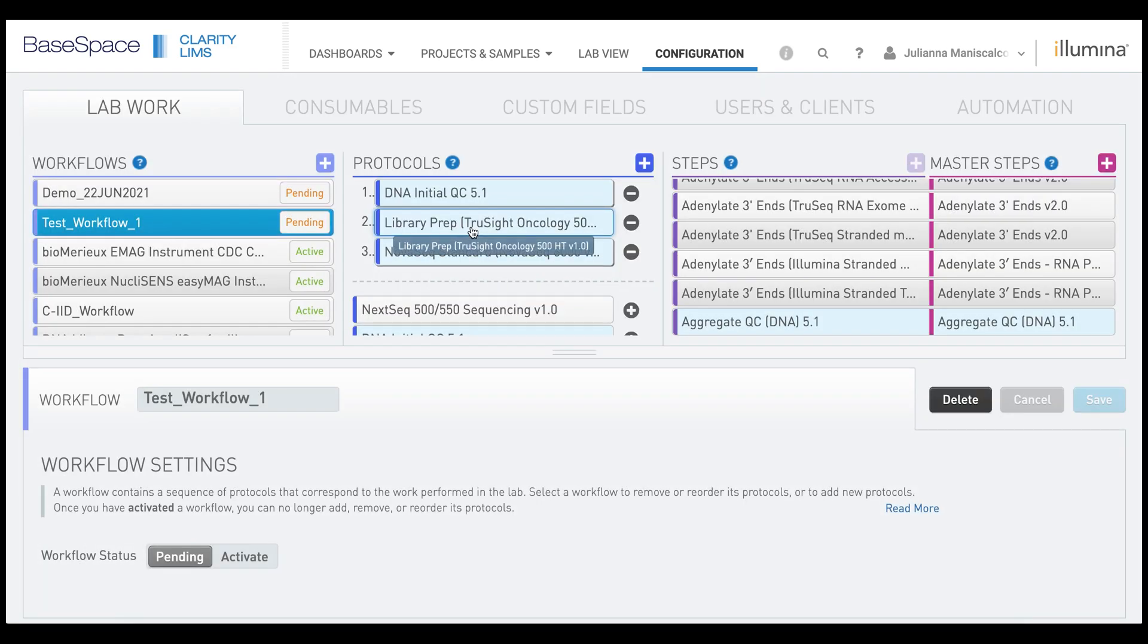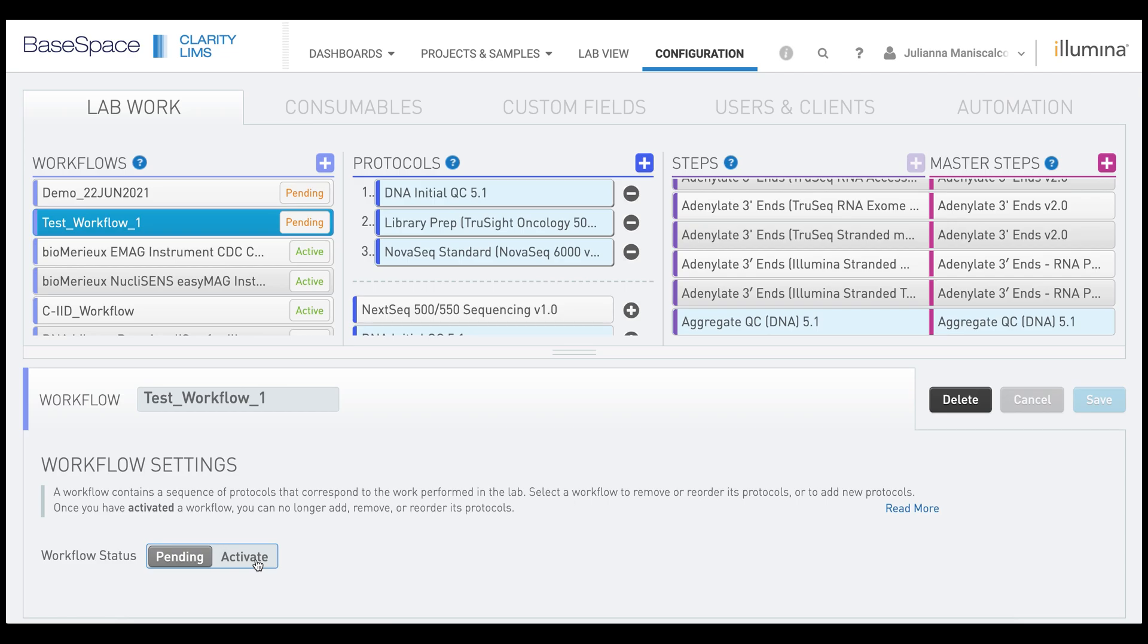Once you have confirmed your workflow looks the way you want it, you can now activate it. Here, we will toggle the workflow status from pending to activate.